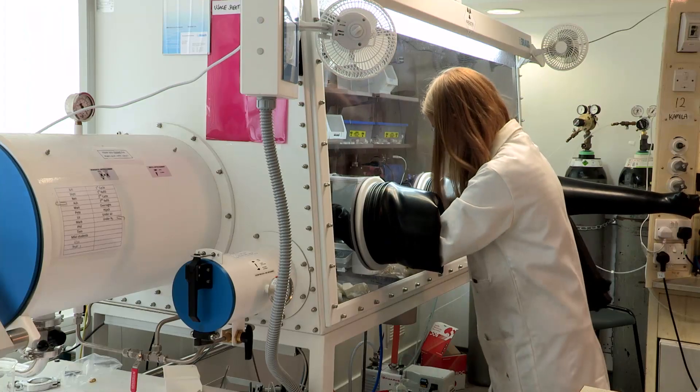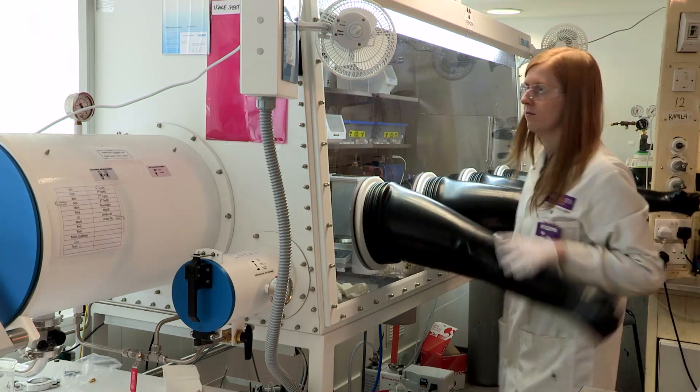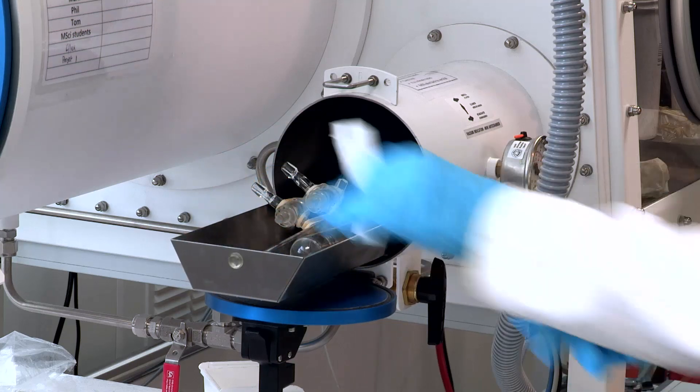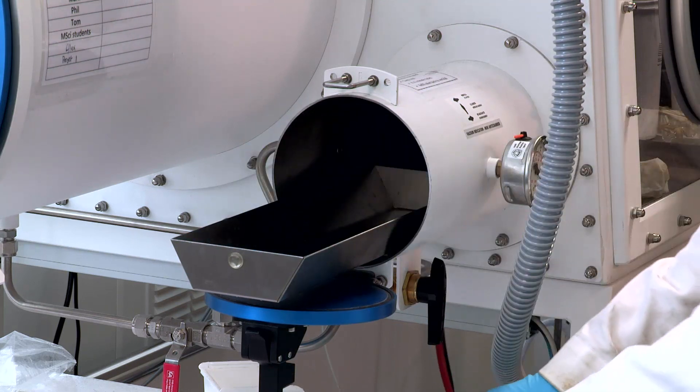The facilities at Manchester mean we have access to the very sensitive compounds that go into this, and we have glove boxes and Schlenk lines that mean we can exclude air from all of our reactions to make sure that these compounds don't go off in the process and that we can isolate them cleanly and have a real look at them.